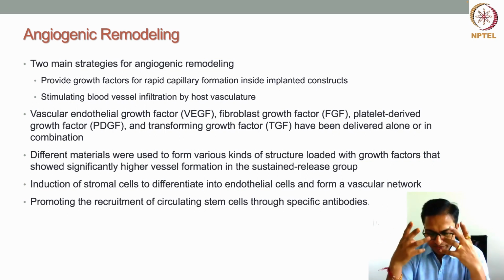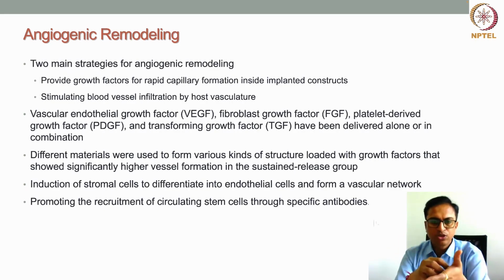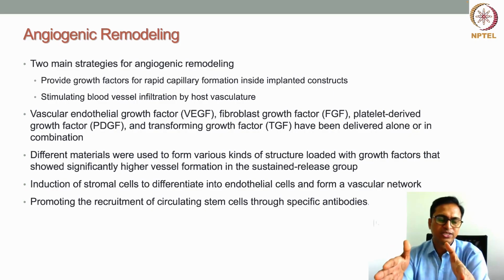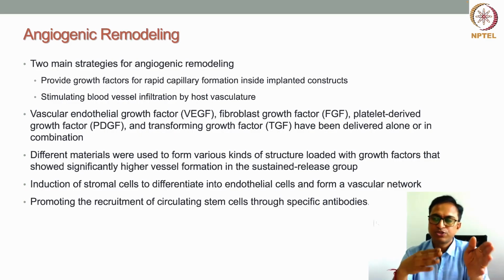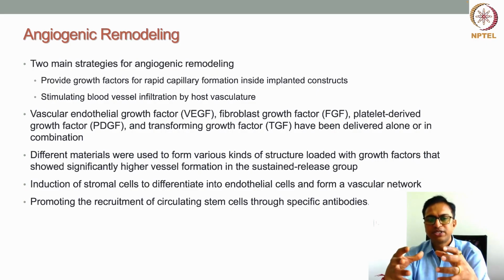When we biofabricate a construct, we can load growth factors in our bioink, and then print the whole tissue along with the cells. Those growth factors can induce rapid capillary formation inside that construct. This is one way we can remodel angiogenesis in the bioprinted tissue construct.